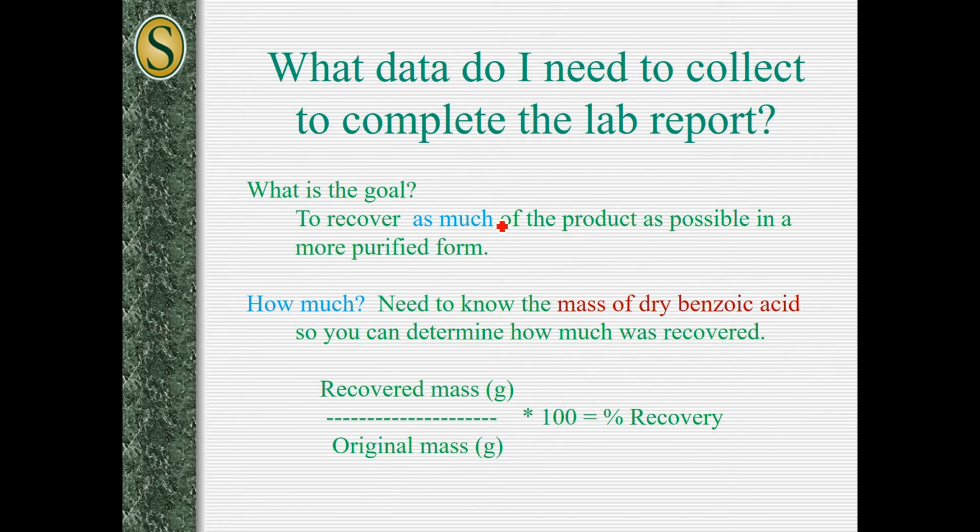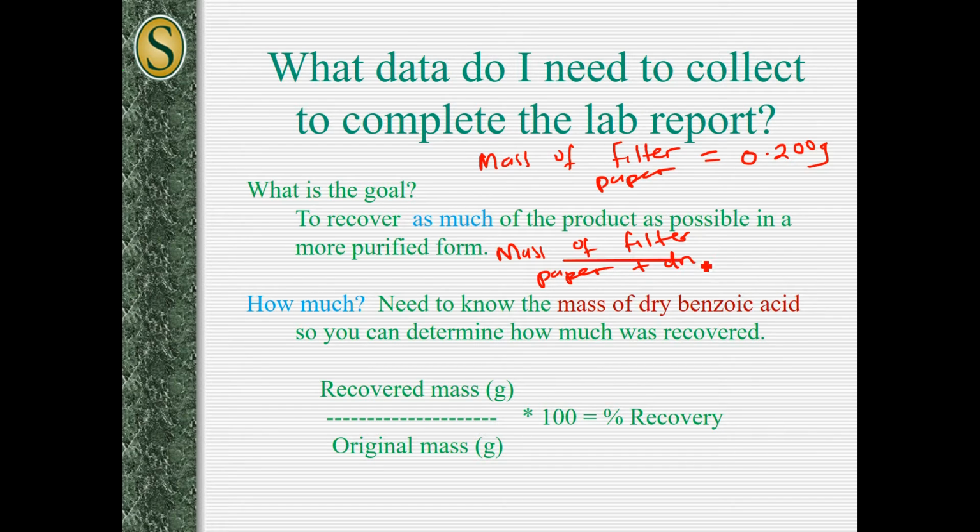Suppose the mass of filter paper only is about, say, 0.2 grams, and the mass of filter paper plus dry benzoic acid is, say, 1 gram.